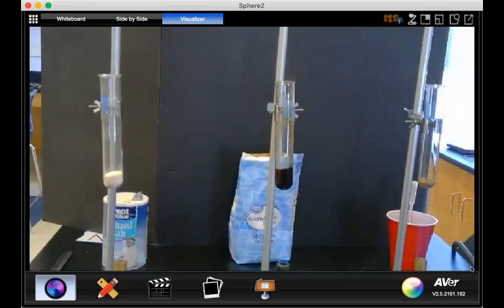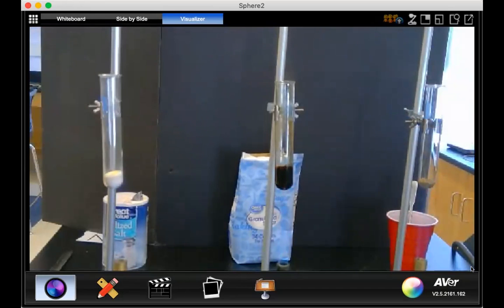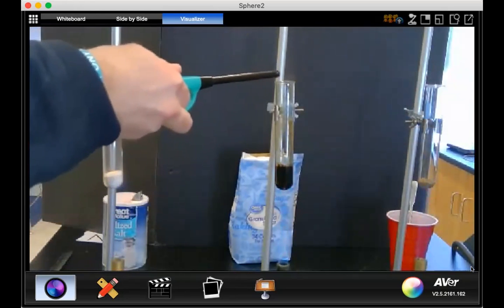We've been going now for 3 minutes. Okay, so we can make our observations. Just 1 more minute left. Again, take an inventory of what we see happening. Salt pretty much is as it began.